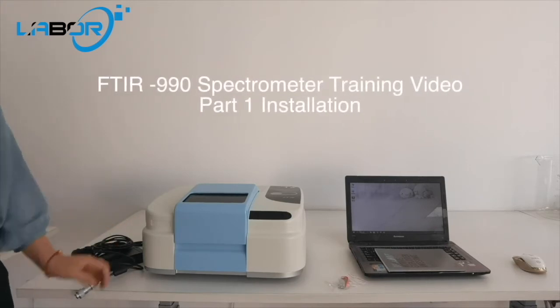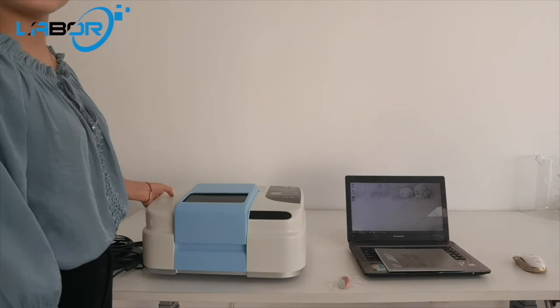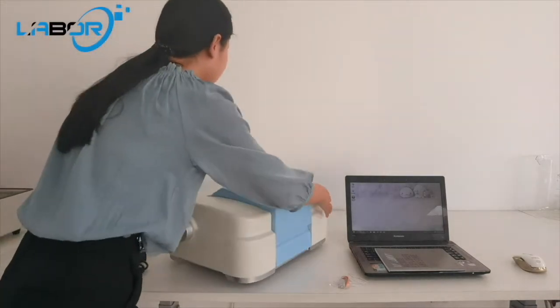Training video of FT-IR spectrometer. This video is for the installation.